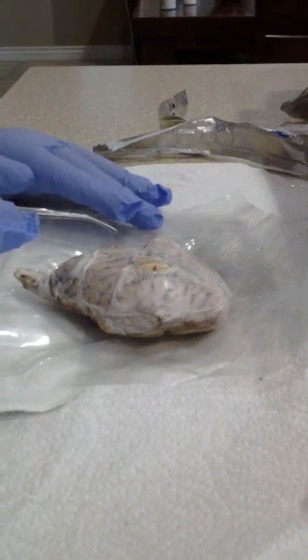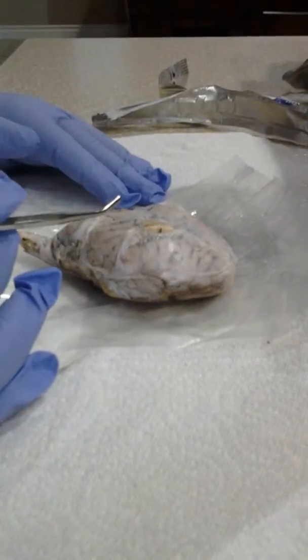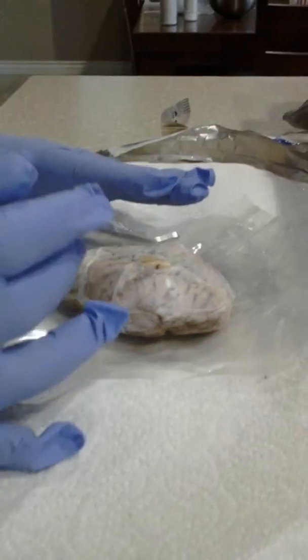Over here is the temporal lobe. It's for understanding language, behavior, memory, and hearing. And last, you have the occipital lobe for vision and color, the rest of the brain.